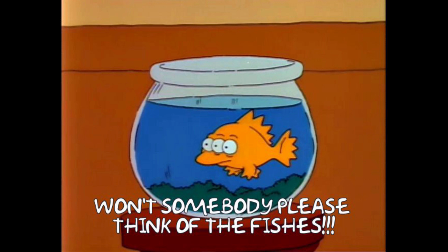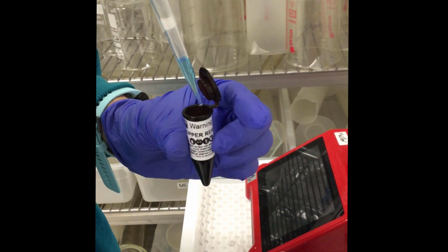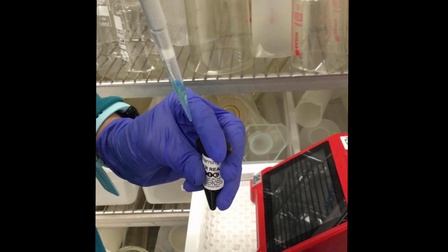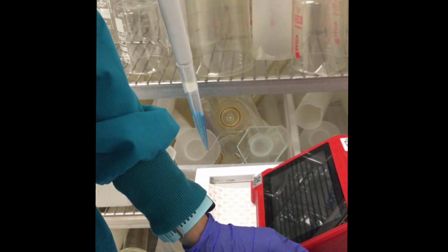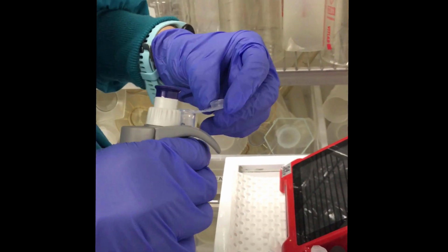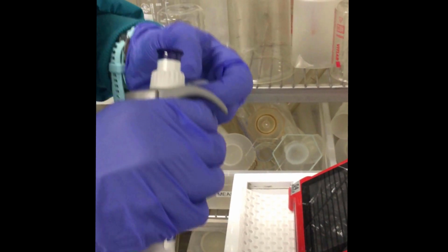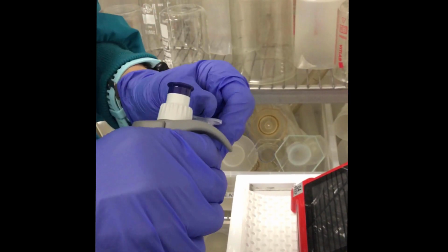Make sure they go into the proper waste containers provided. You need to make sure that any copper reagent that's left over from your practical is put in a waste container and not down the sink. So we don't leave it in the Eppendorf tubes? We can leave them in the Eppendorf tubes provided you seal them and then toss them in the clinical waste.